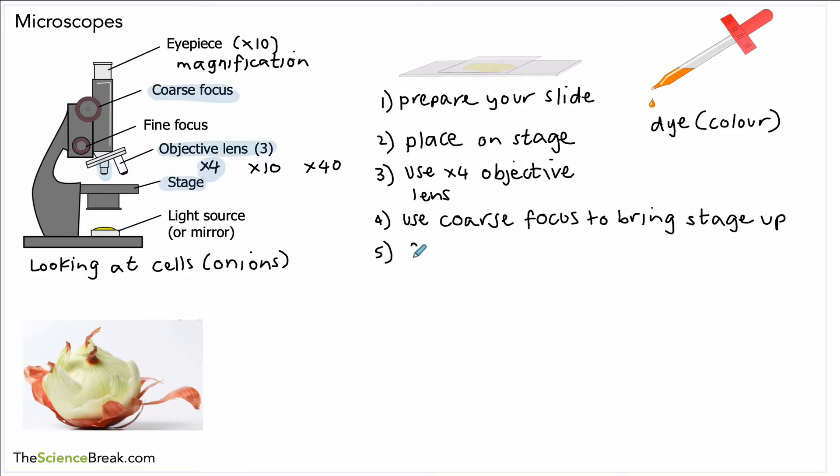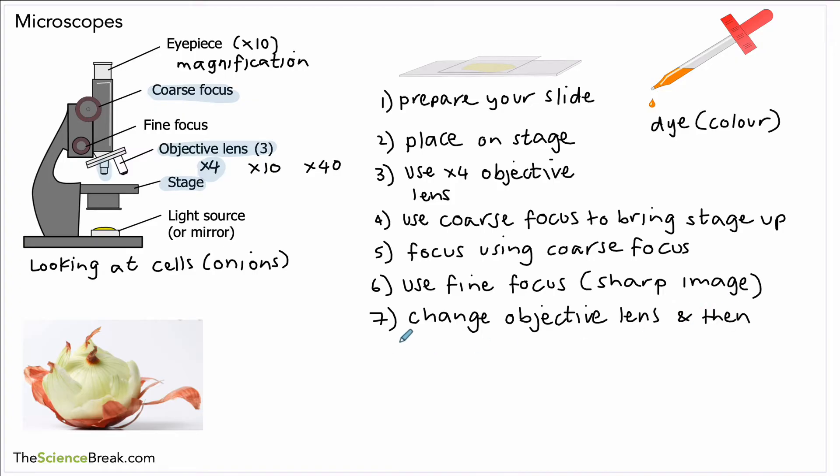Then we very carefully focus on our image again using the coarse focus. The coarse focus moves the stage quite quickly. Once we've got an image we can then switch to our fine focus, which moves the stage very slowly, and we can use that to get a very sharp image. If we want more magnification, we can just change the objective lens to one with more magnification and then use the fine focus to get a sharp image.